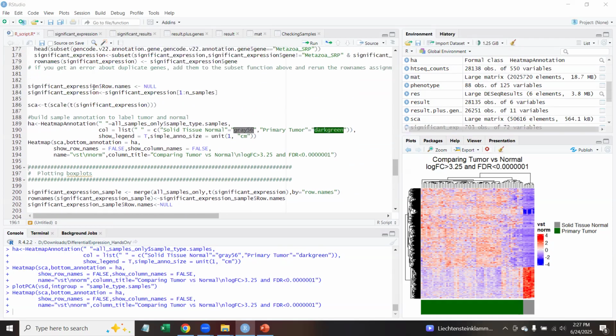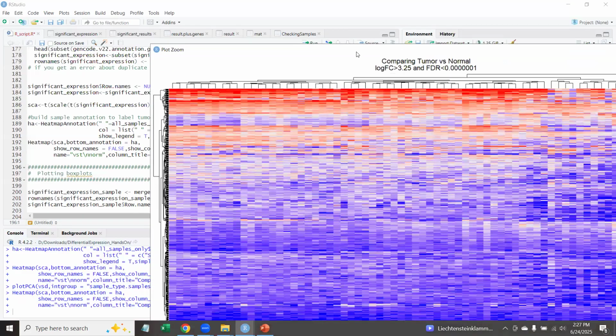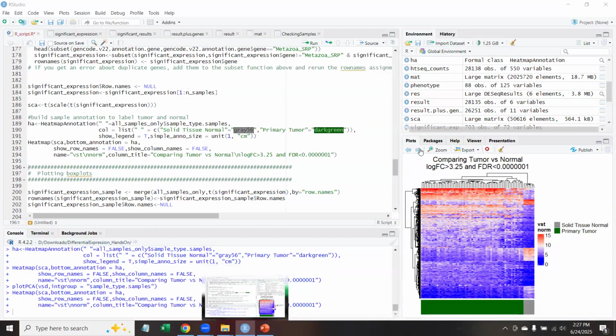Now, it wouldn't make any difference plotting the expression. This is always going to look sort of poor just because they're not on the same range. So this is never going to be that good.